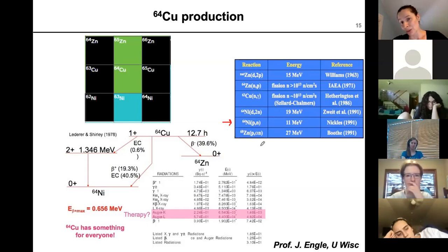So even though the reaction itself is very accessible, the sort of minor challenge is the target having to be isotopically enriched. As you can see, there are more than one nickel isotopes. There are more than two nickel isotopes. There are actually a number of them. So actually getting an isotopically pure nickel 64 sample is a fairly painful and costly endeavor. So what I'm going to show you in a bit is that people actually have to recycle these targets when they use them. So first, let's talk about this PN reaction and the logistics of it.